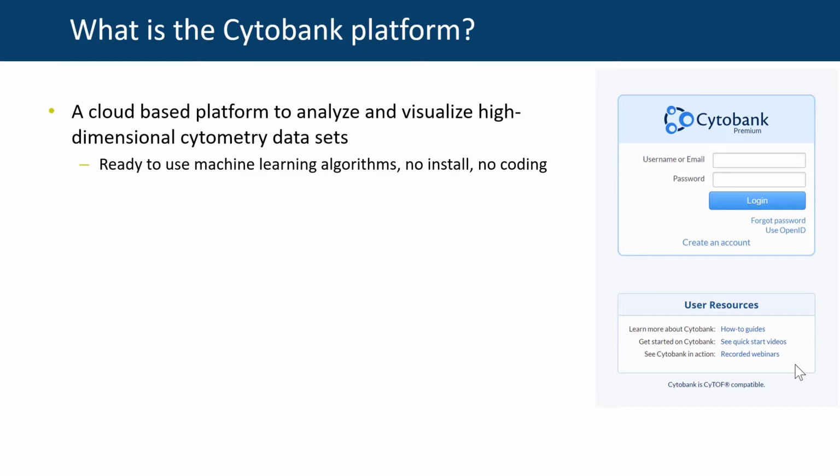Also, because we have everything fully integrated in the platform, we're not going to have to worry about installing plugins, and we're not going to have to worry about knowing R to access these algorithms. Everything's going to be fully integrated within the Cytobank platform.